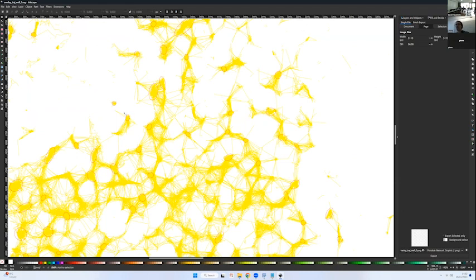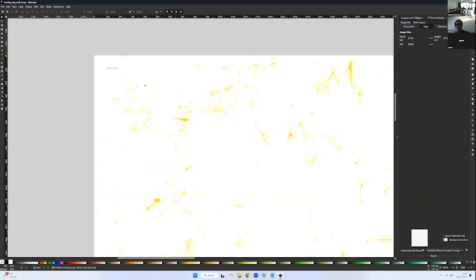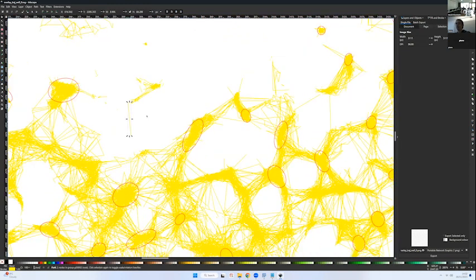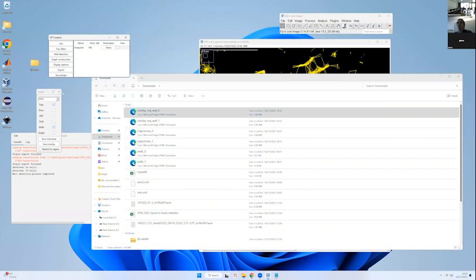All right, that's the overlay. You got your scale bar somewhere. And so this you copy paste in your paper, and that's done, right? These are vectorial, so I can say, I don't like this trajectory, let me remove it, or whatever. All right. So that's the export, and that's all there is to it for the wells.